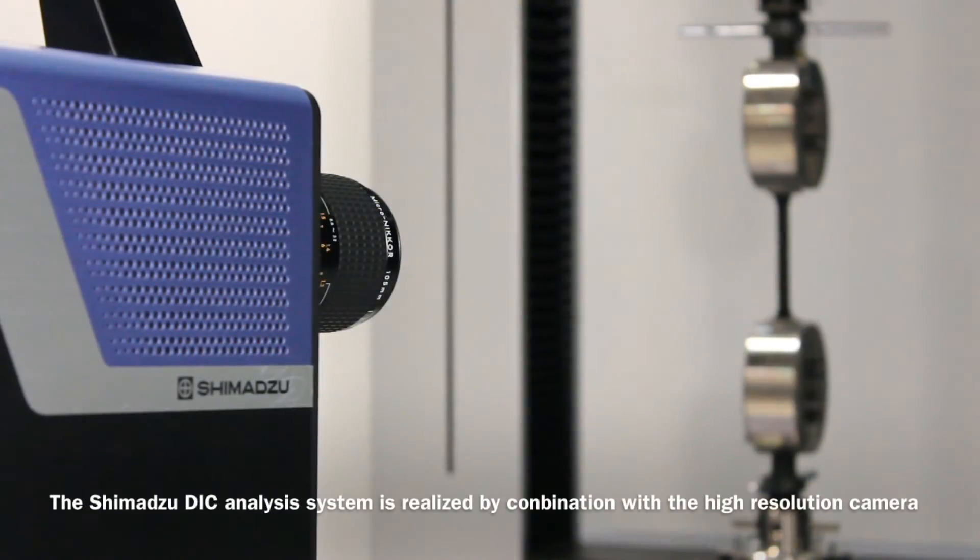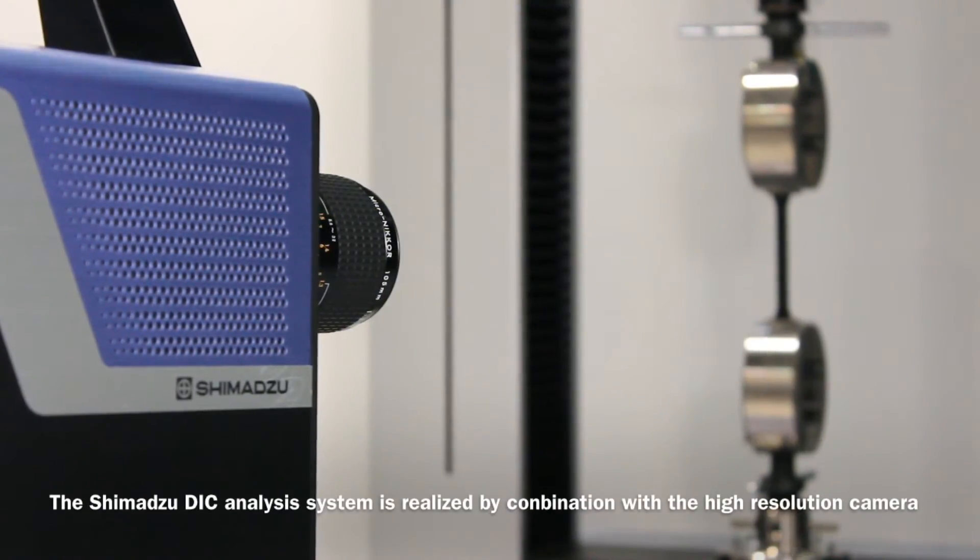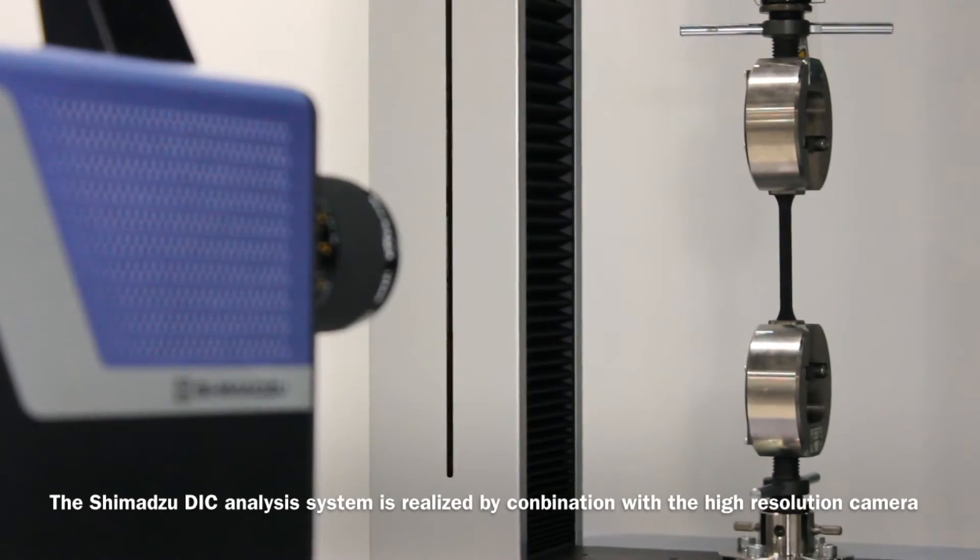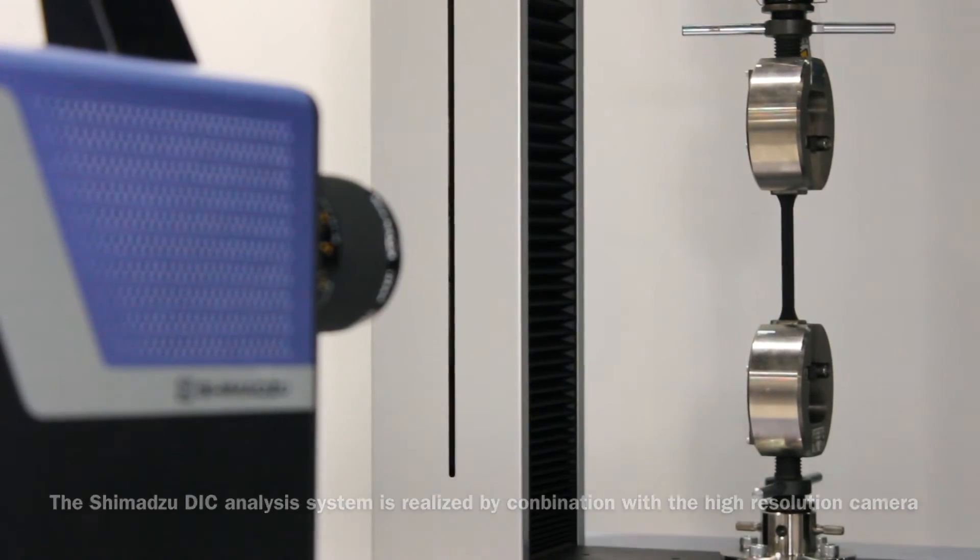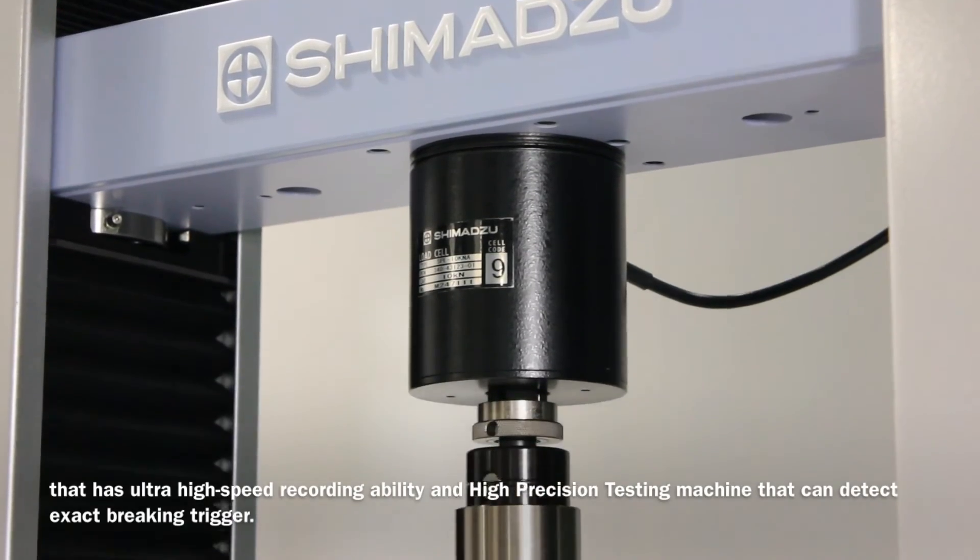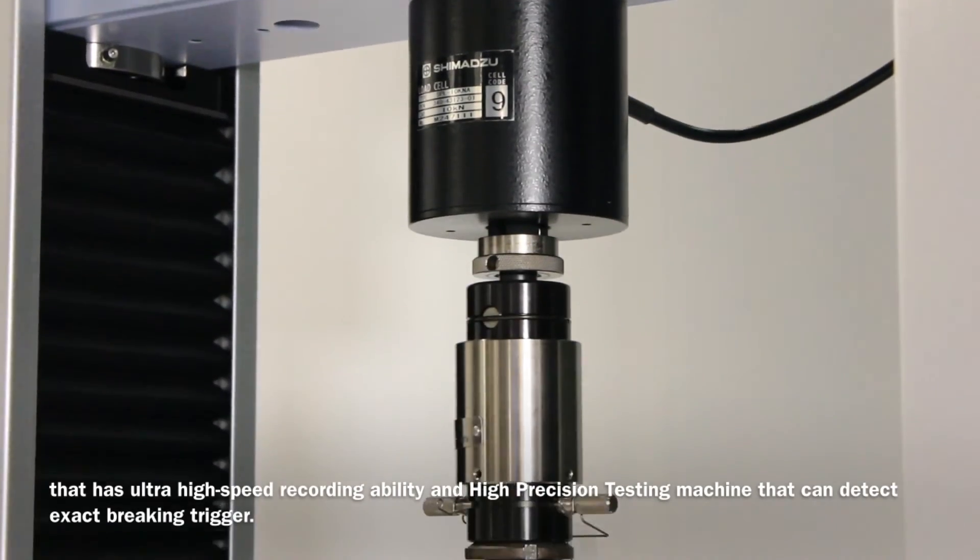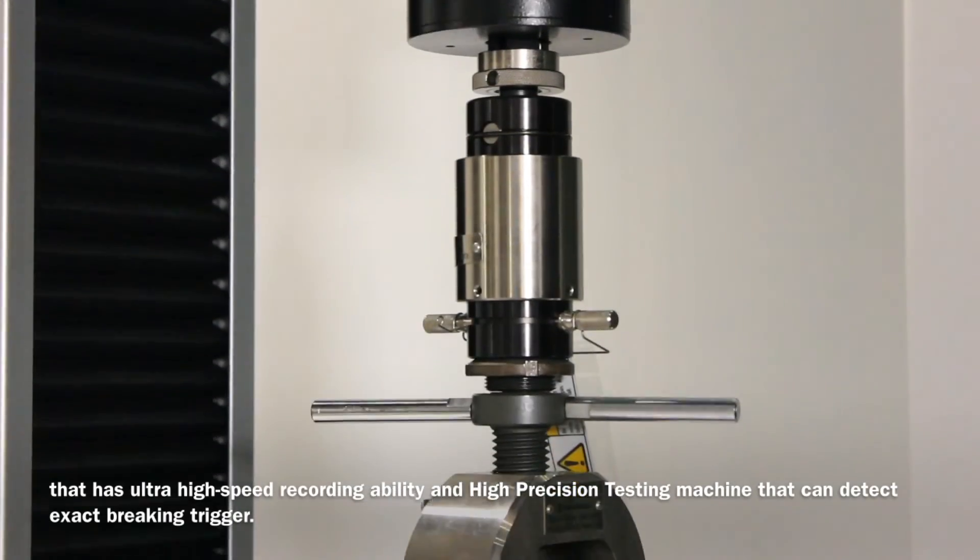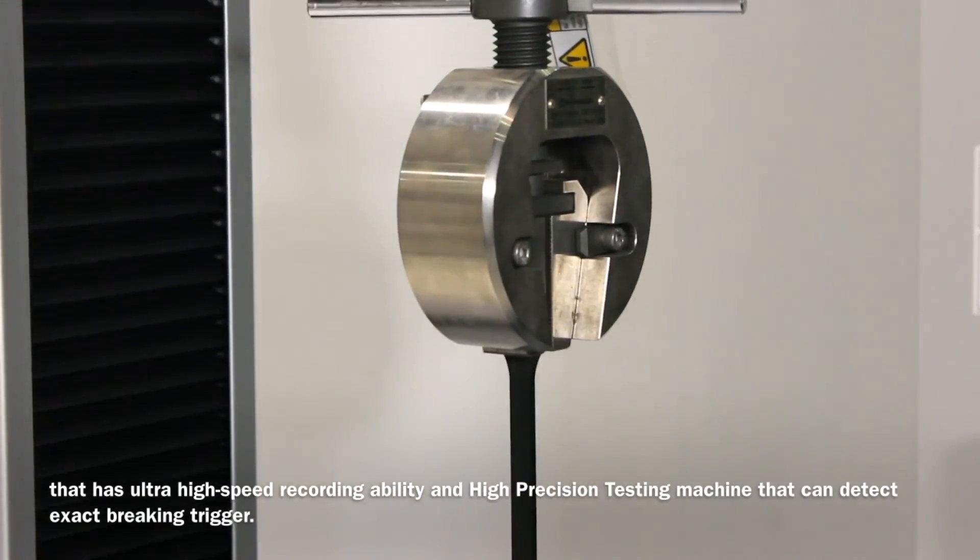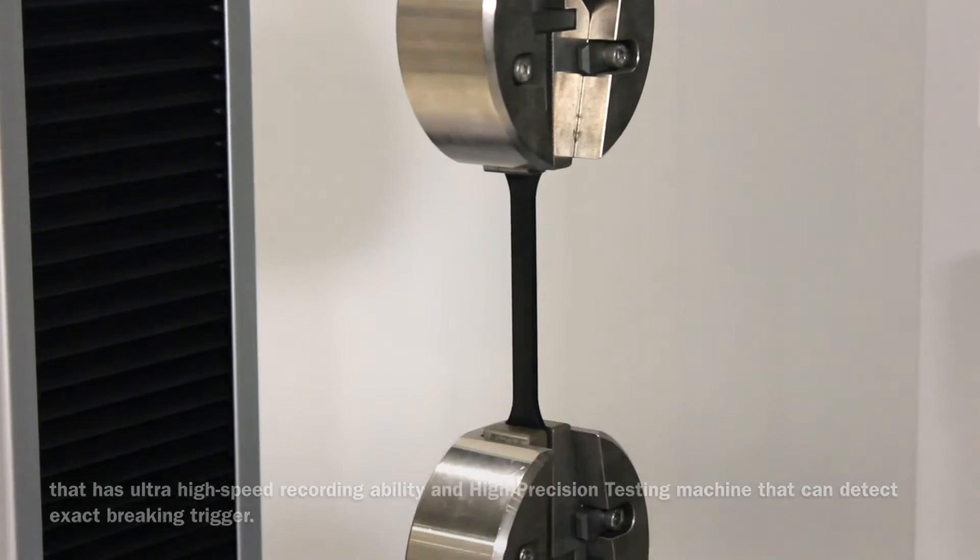This Shimadzu's DIC analysis system is realized by combination with the high-resolution camera that has ultra-high-speed recording ability and high-precision testing machine that can detect exact breaking trigger.